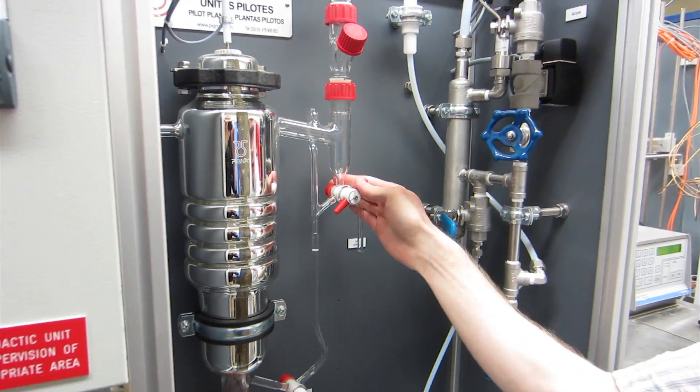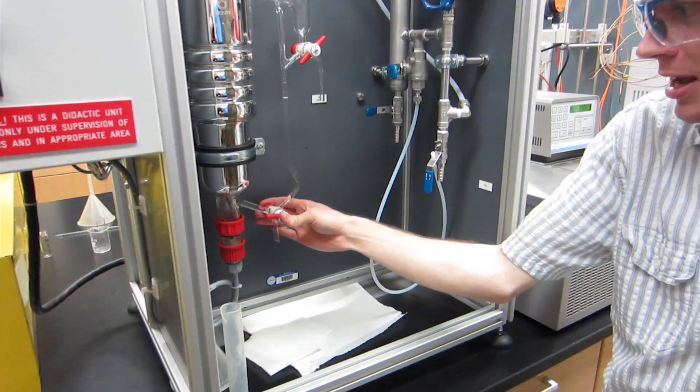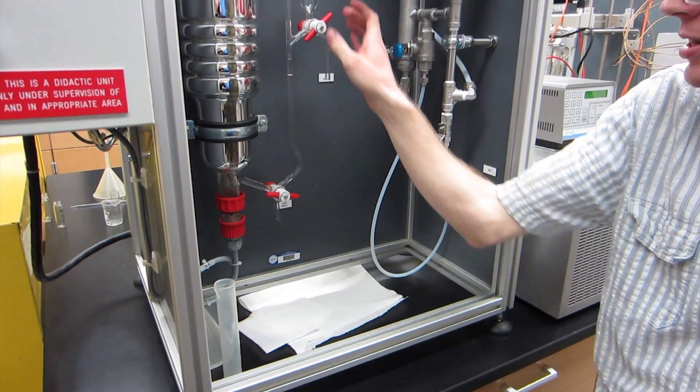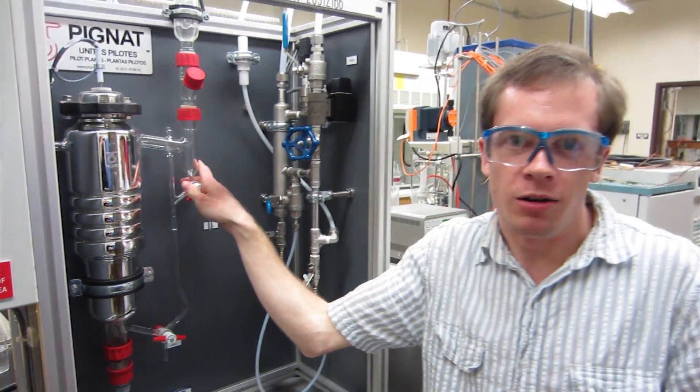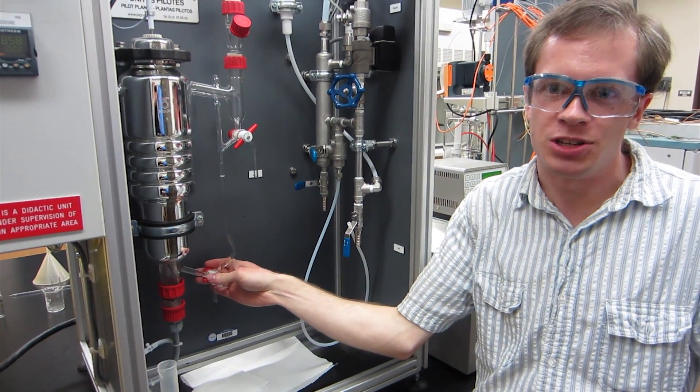And here we can take samples of the distillate and here we can take samples of the liquid. The distillate tells us what our vapor composition is and this can tell us what our liquid composition is.